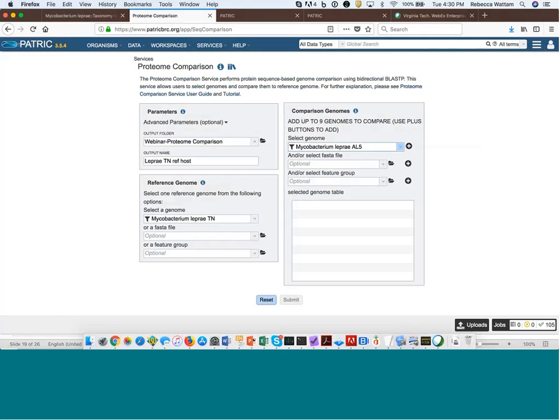See, I still can't submit anything. To do that, you have to press this plus icon. And there it is, and suddenly, look, if I wanted to, I could submit this job, but we want to add more than that.